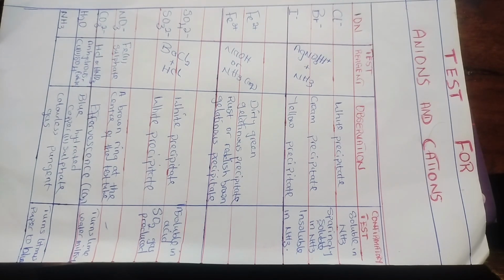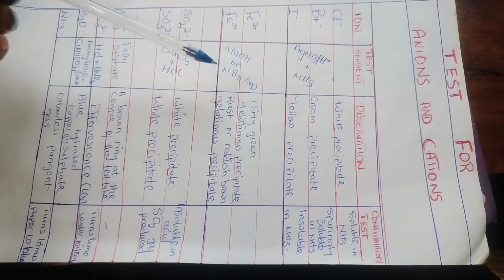Now, let's go to the test for the iron 2 ion and the iron 3 ion. The reagent we use for that is sodium hydroxide or ammonia.